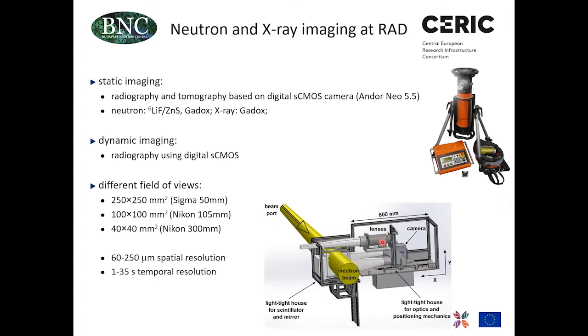We have 3 commercially available optics, which are interchangeable, and by means of this, you can change the field of view. We can set a relatively large field of view with moderate resolution, or we can set a higher resolution, but at the expense of a reduced field of view.